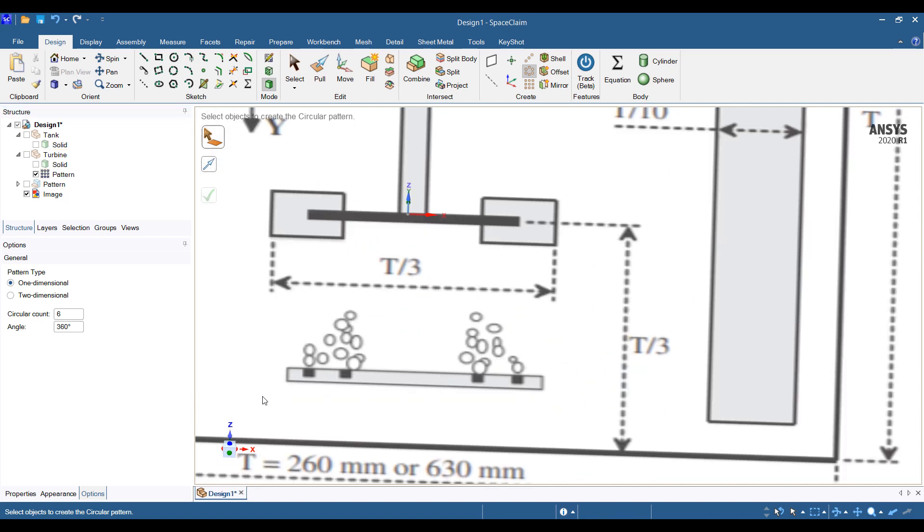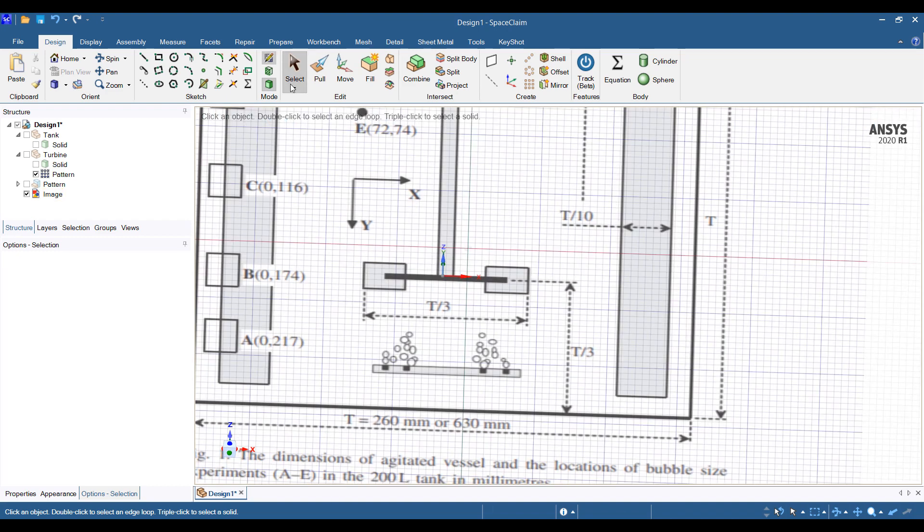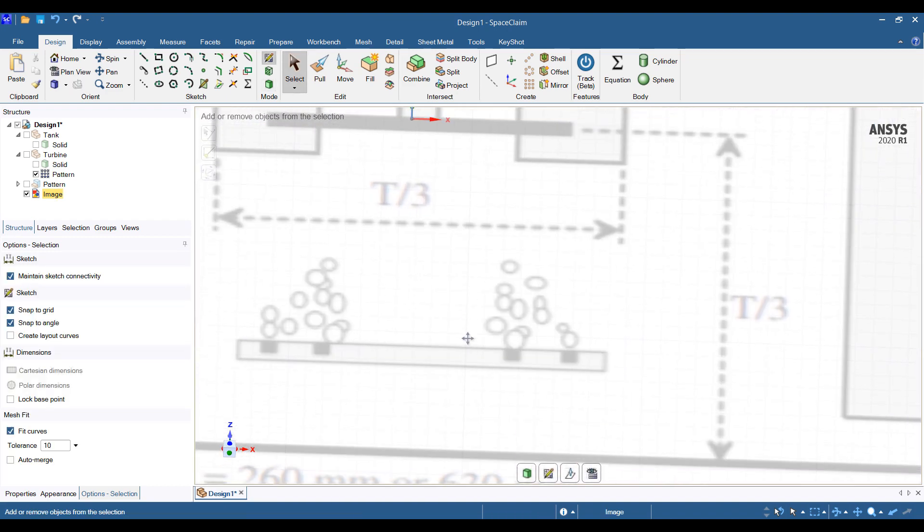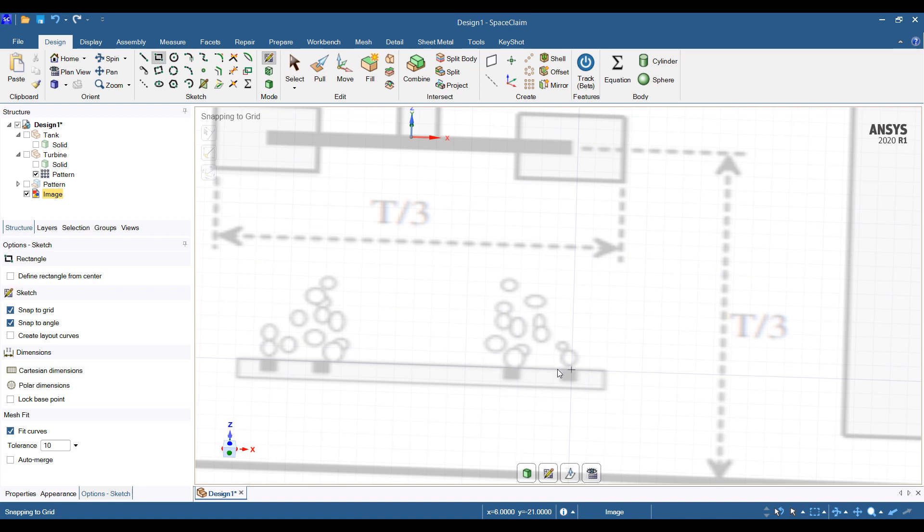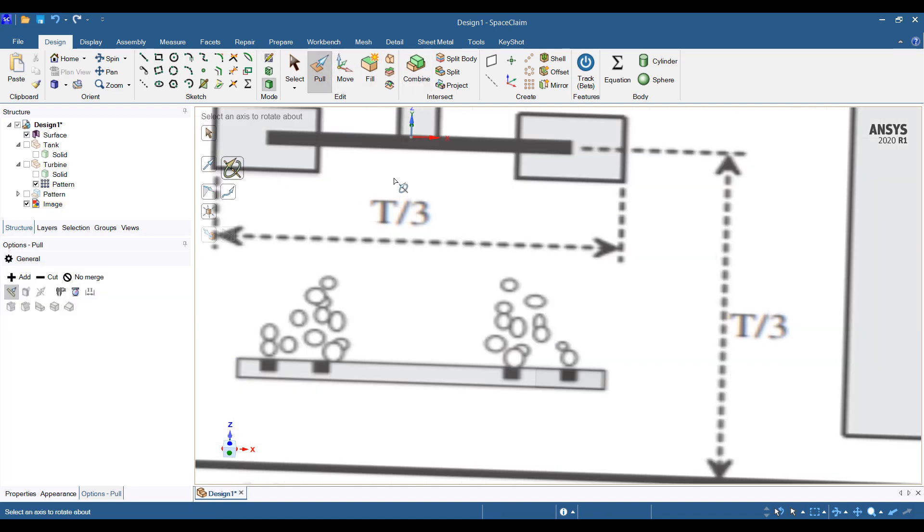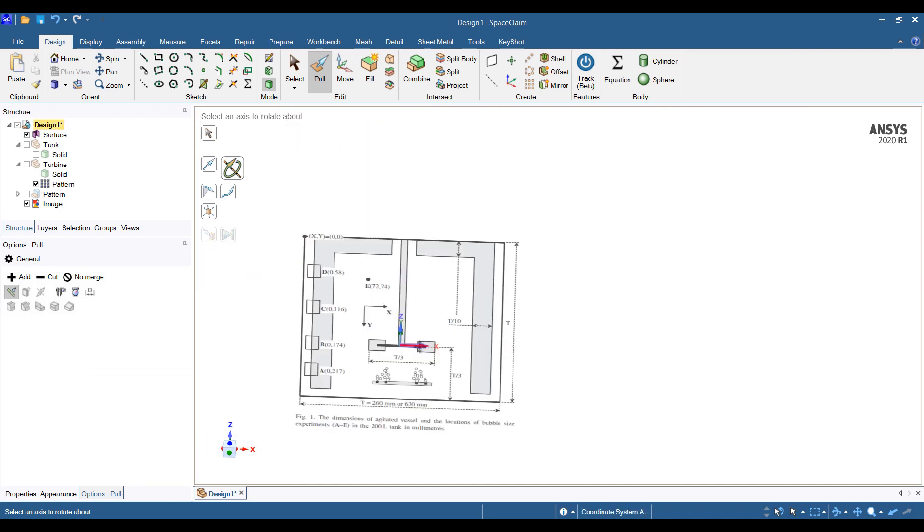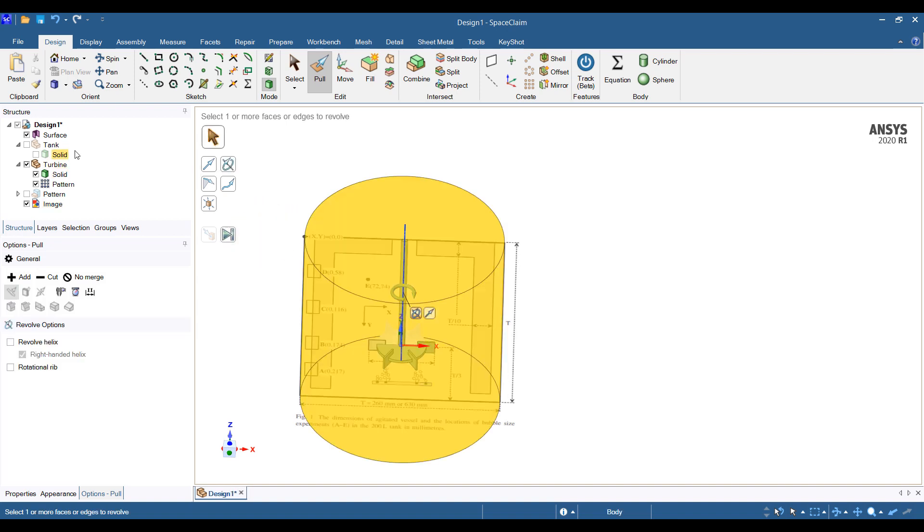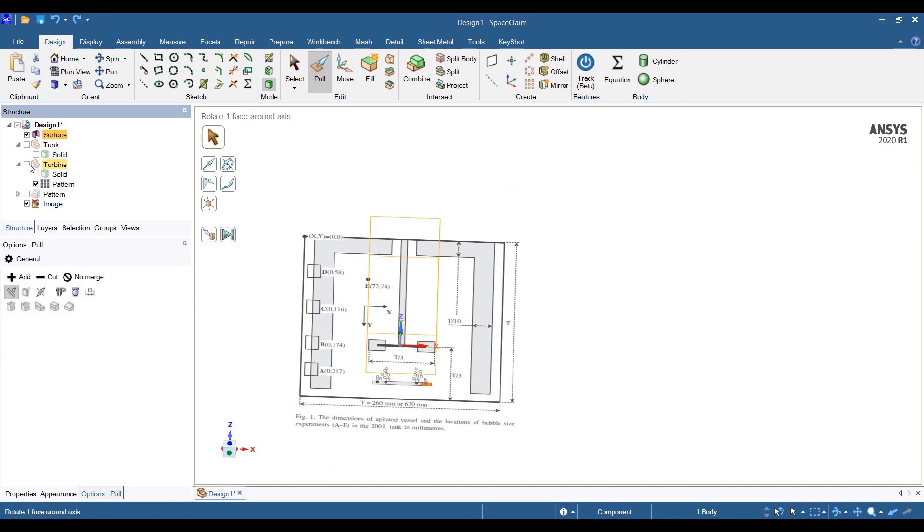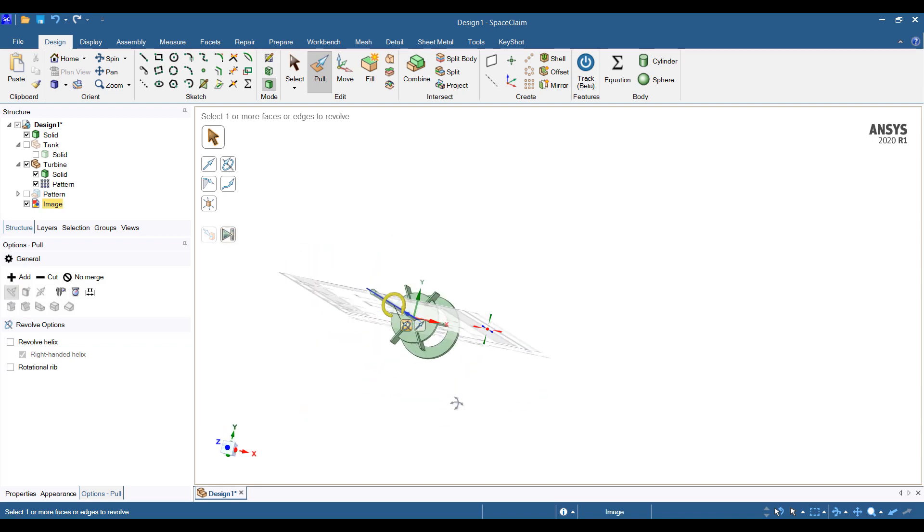And finally we'll just need the sparger. Center is right about there. So let's go ahead and do it. It's a ring sparger, so I'm thinking something like this. Do a quick revolve around the center of the turbine. Oh I think I didn't do that quite correctly. Let's go ahead and... there we go.